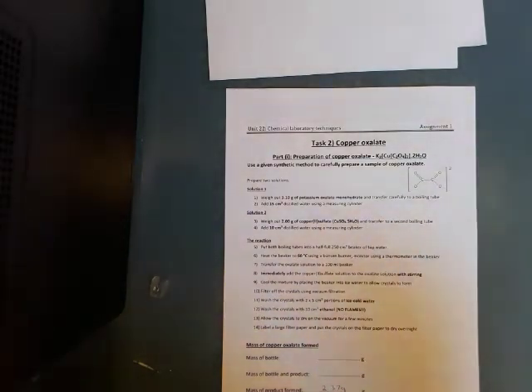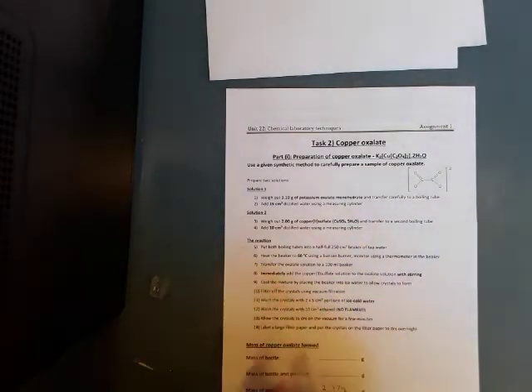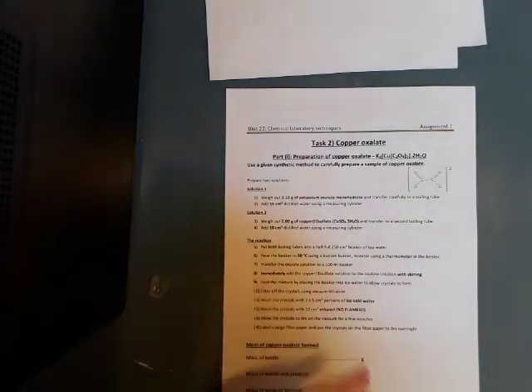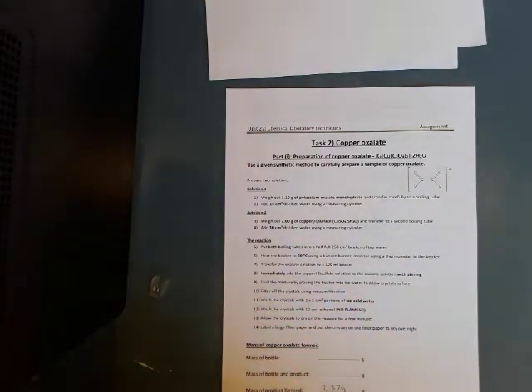Again, it might be that we're not stirring it properly. We're maybe not monitoring the temperature as well, which of course we need that temperature to drive the reaction. So it could be that we could use a temperature probe to measure the reaction temperature. We can maintain that better, but also with stirring, it might be that we look at different ways of doing that, maybe using a magnetic stirrer. So you've got a constant movement of that solution.